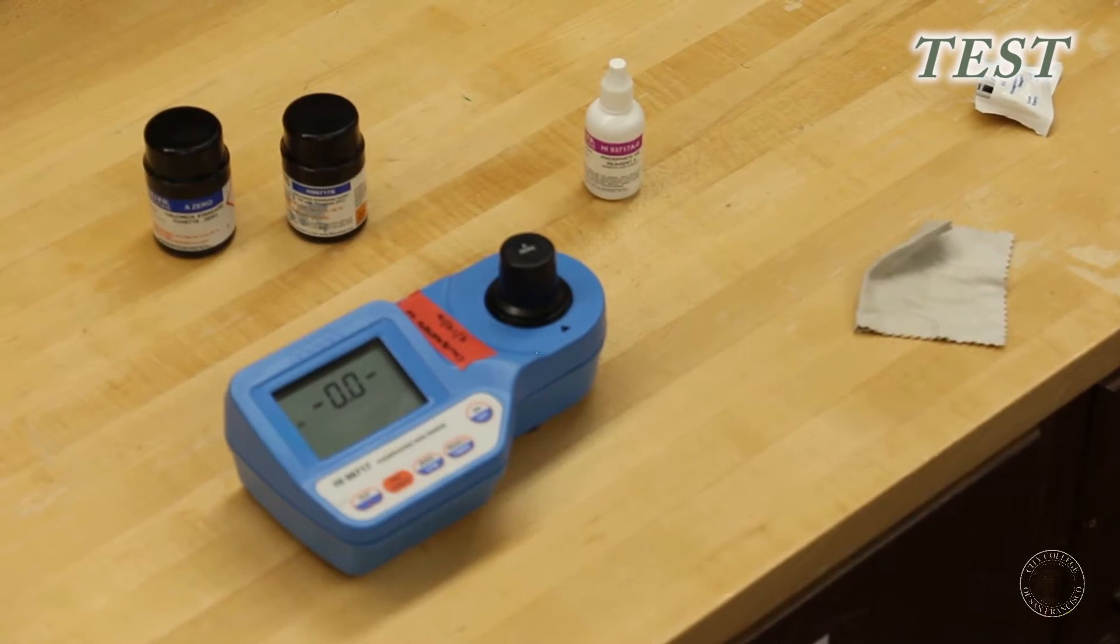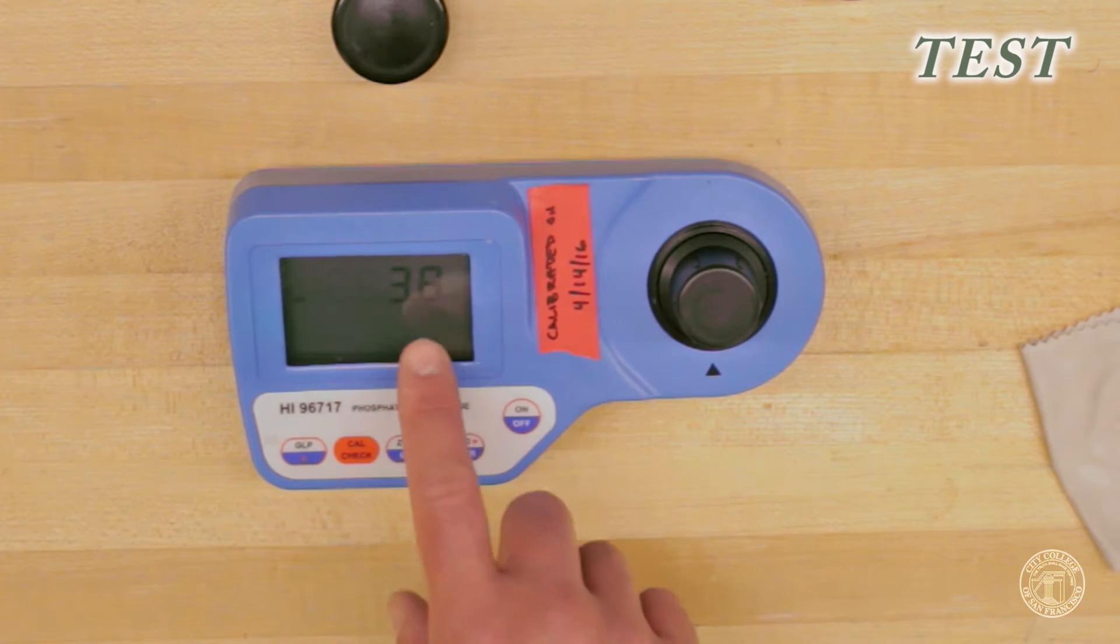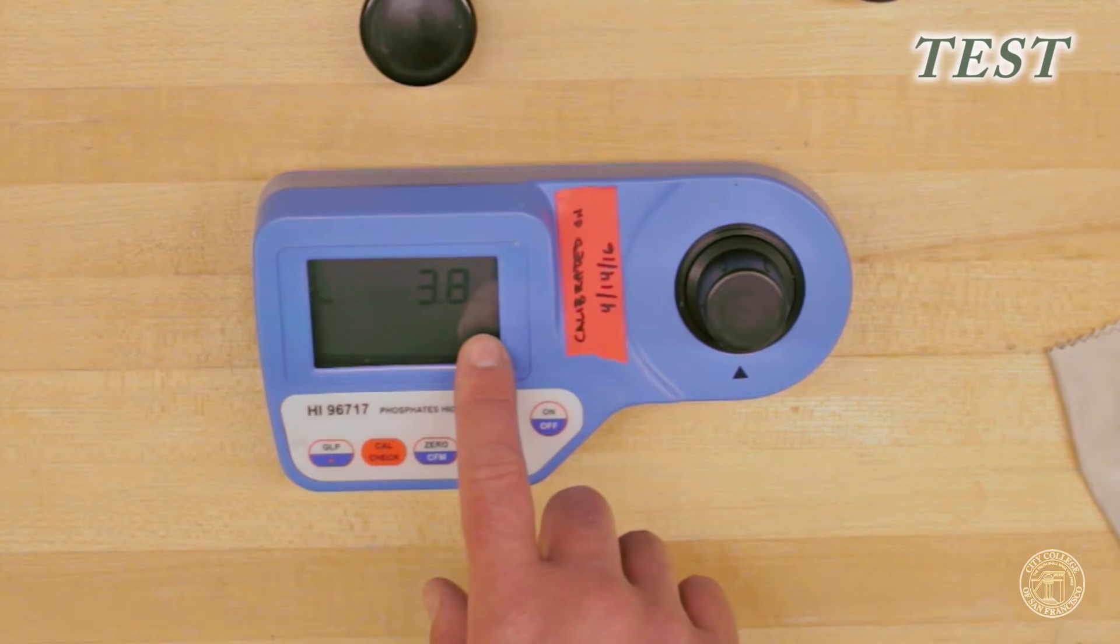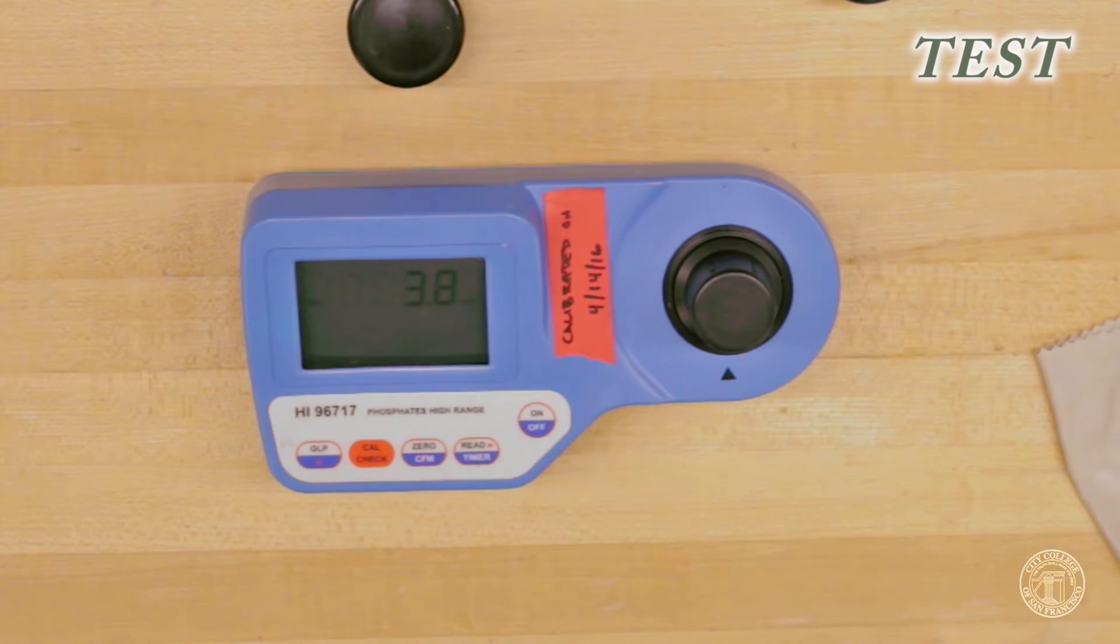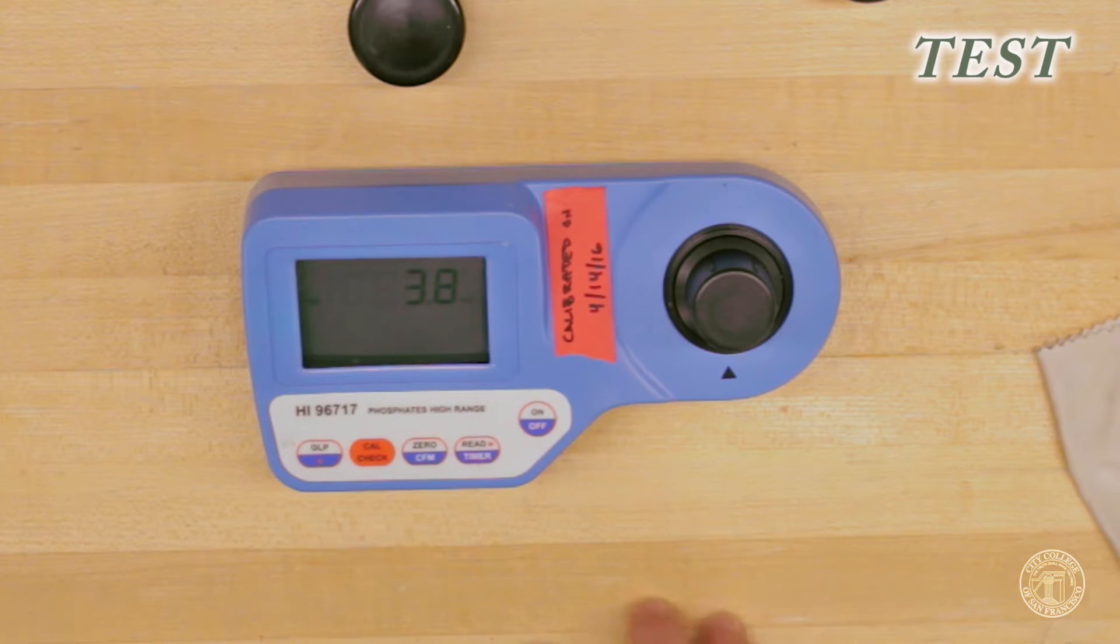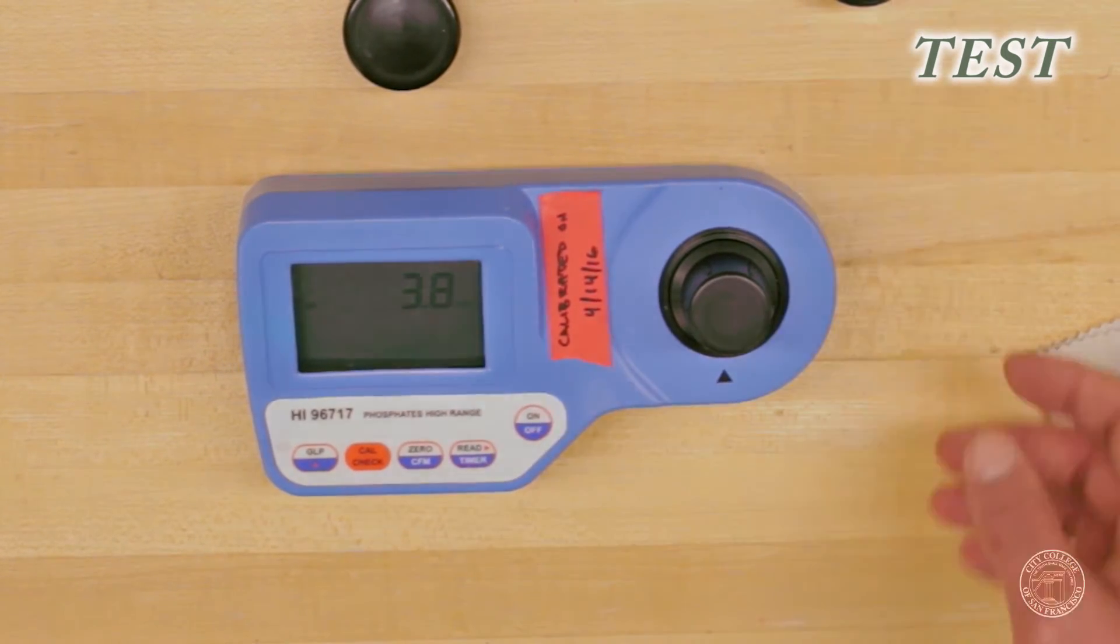And now our timer is done. After five minutes, it will read the sample here for us. And this is tap water, so thankfully we have a very low reading of 3.8 milligrams per liter. And that is the steps to calibrate, validate, and then take a sample with the Hanna Phosphate High Range HI-96717 meter. Thank you.